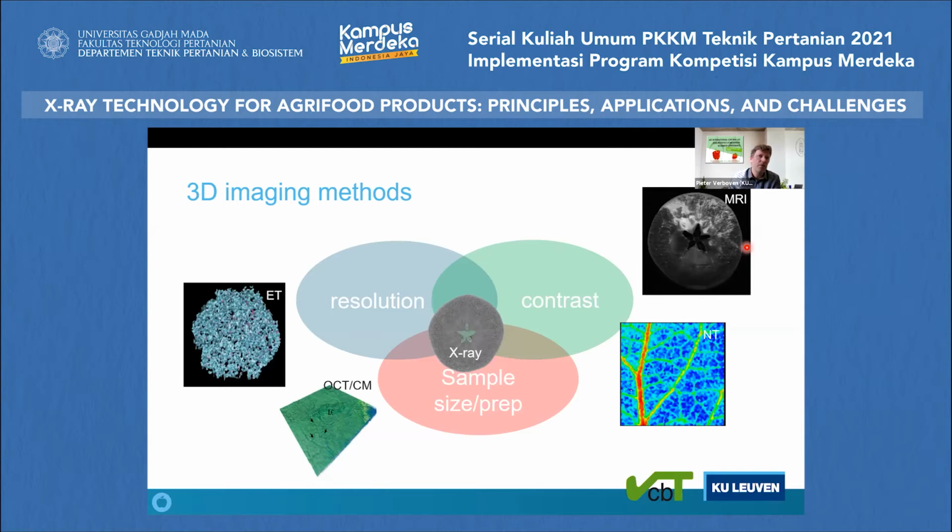So it's mainly related to looking at water relationships and not as much structure. So it may not be that appropriate. It also suffers a little bit from resolution issues. So you cannot get to that high resolution. And by resolution, I mean, what kind of detail can you see in a material? To what kind of dimension can you see something in the material? And typically with MRI, you can see things down to 10 micrometers, the smallest items that you can see with MRI.